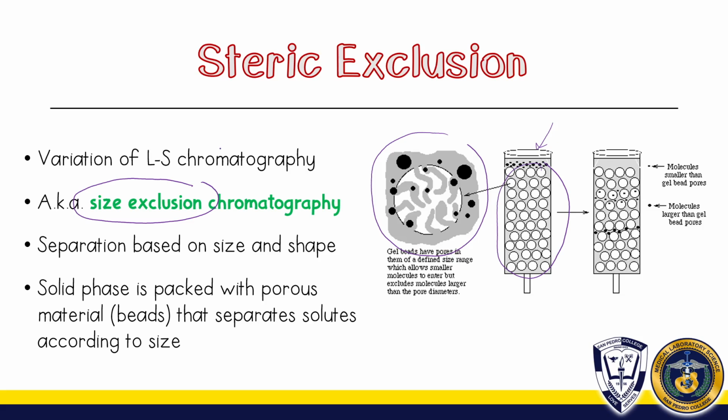Those bigger particles, since they cannot enter inside the beads, remain outside, and they are the first to be removed out of the column.